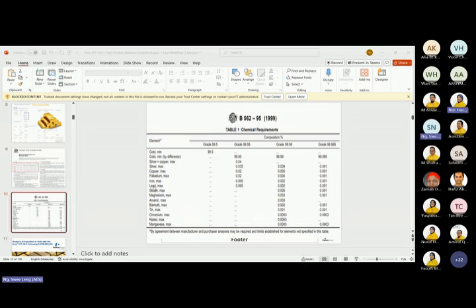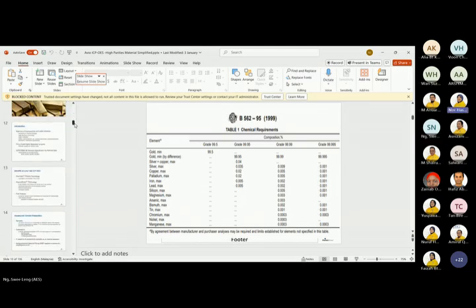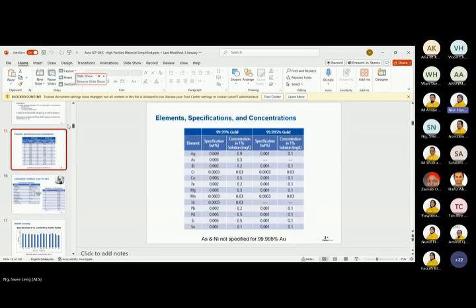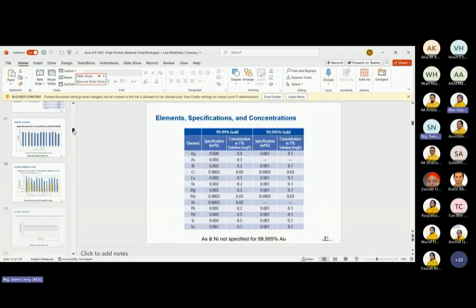We have to trust whatever the person says. They are already 99 point something, but whether it is 2N, 3N, 4N or 5N, these are the methods that we test. So we are not looking for the main element. We are checking the trace impurities. Yes, correct. So that is gold.